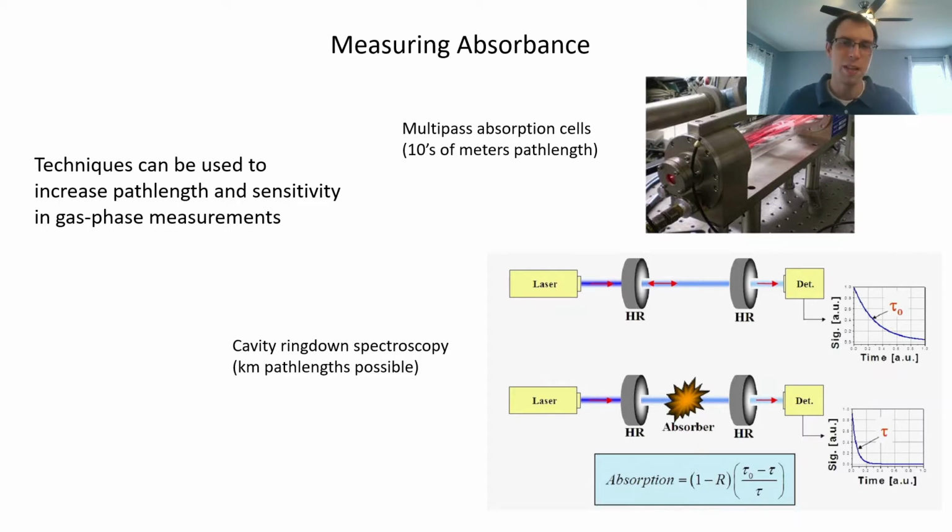So one of the big limits on absorbance spectroscopy is that the amount of signal you get, your A value, doesn't only depend on concentration, but also depends on path length. So if you're trying to measure something with very small concentrations, if you have a small path length, you're not going to get very much signal to observe, and it might not rise above the noise level or the background level of signal that you get just from your instrument itself.